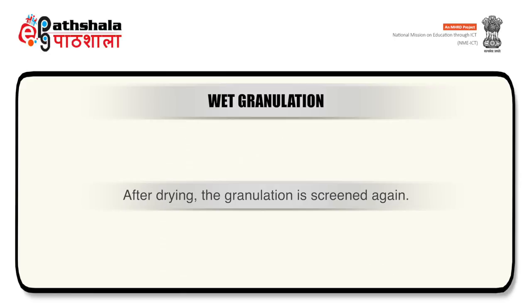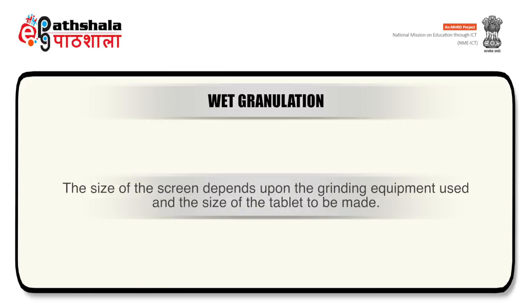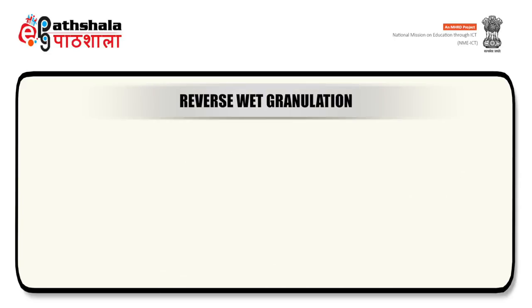After drying, the granulation is screened again. The size of the screen depends upon the grinding equipment and the size of the tablet to be made. Wet granulation has witnessed various technical innovations, which are further described in the module. Now let us discuss reverse wet granulation.